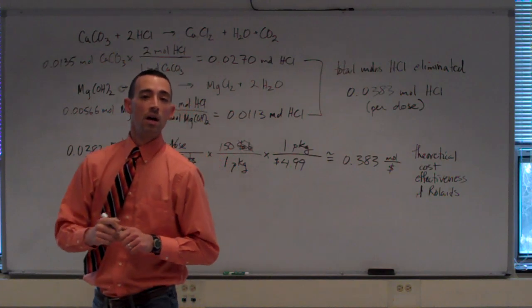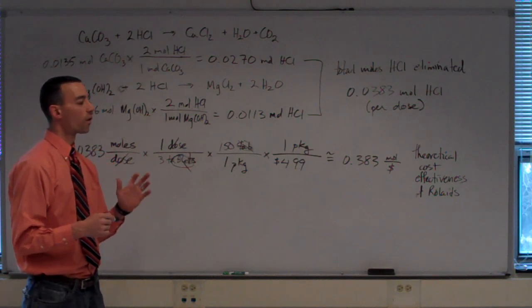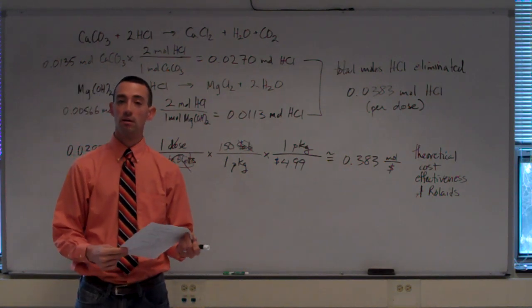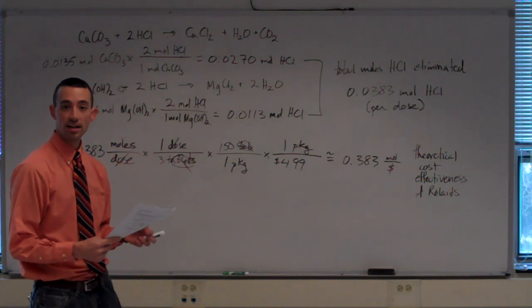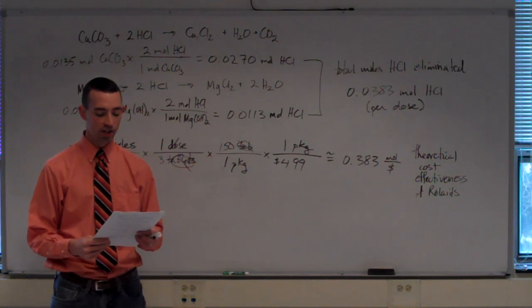As part of your lab work today, you'll need to calculate the theoretical cost effectiveness for each of the antacids that are included in a table that you'll find in your laboratory manual. So that would include Rolaids, which we've already got done, then the Tums antacid, Mylanta, Malox, and milk of magnesia.